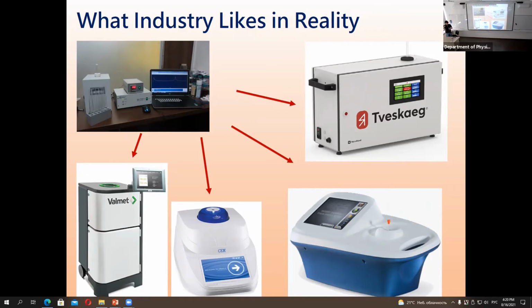It is just very small. You put the test tube with a food product, and it gives you in some minutes the total amount of fat inside. So this one is multi-nuclear. There is a magnet and different sensors. The Norwegian people, and actually it's quite cheap. It is $12,000. You have the sample that is flowing inside and then getting out, and it is measuring the content of different nuclei, different isotopes. For example, aluminum, phosphorus. What else? Fluorine, hydrogen, so many different nuclei.